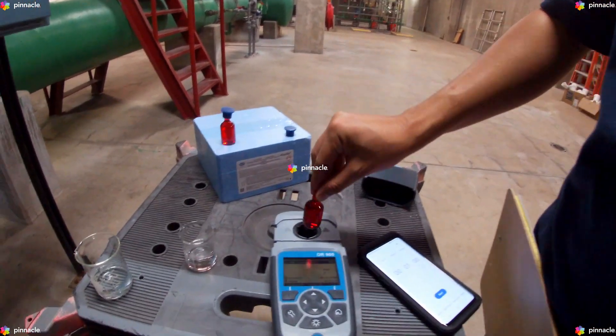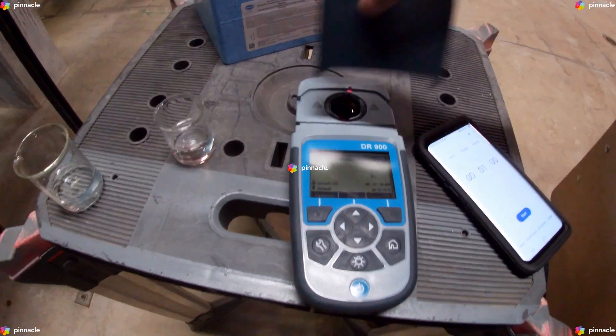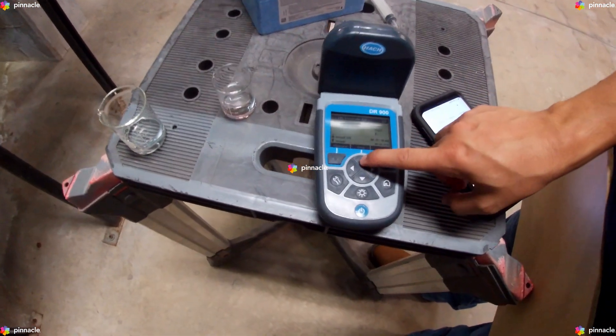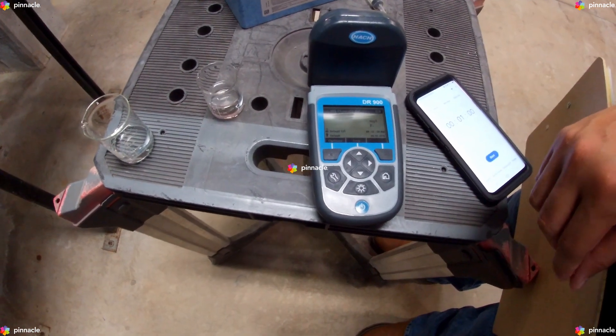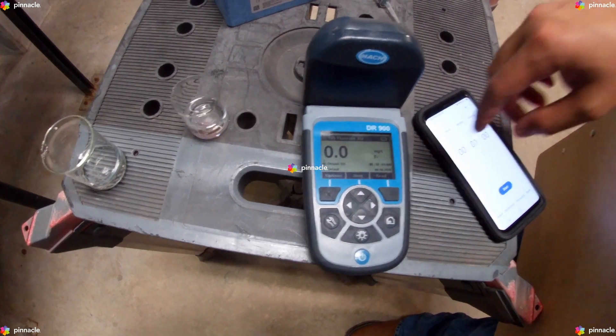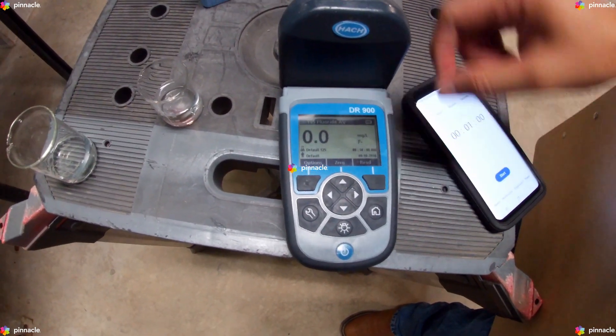We will insert the blank AccuVac Ampoule into the cell holder of our DR900 pocket colorimeter and press zero. The display shows 0 mg per liter of fluoride.